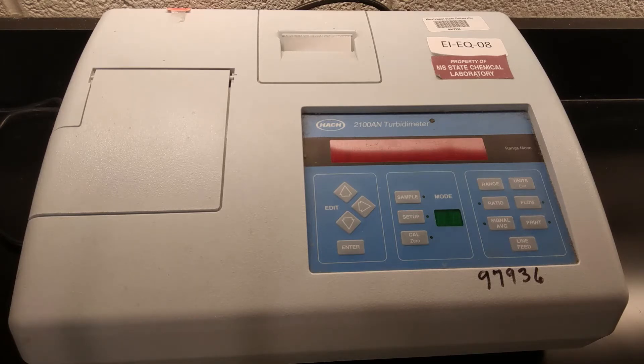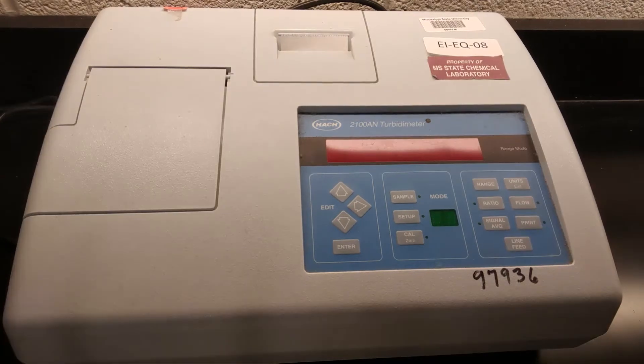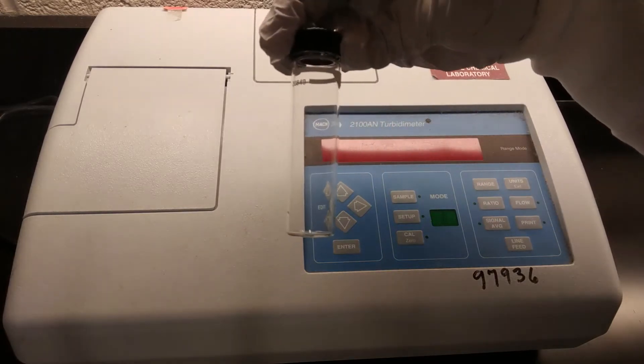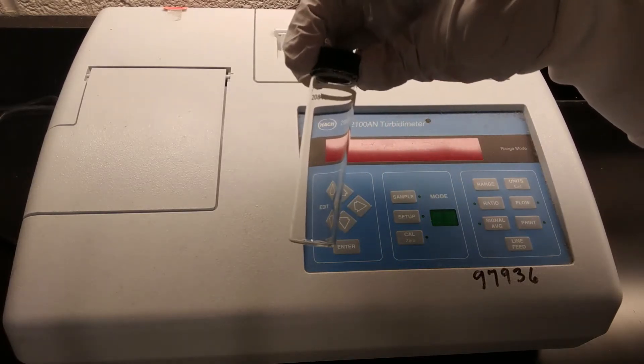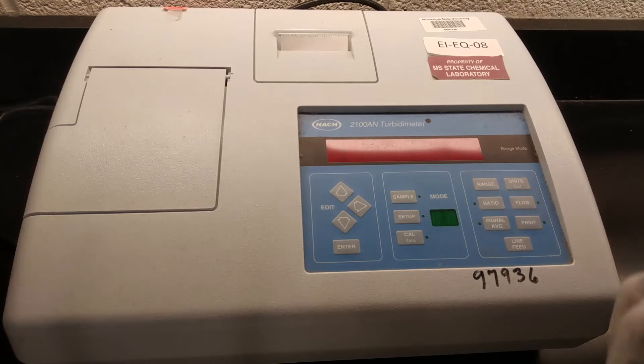Most of our supplies for our turbidimeter are kept in the drawer just underneath it, so we have everything that you need for it right down next to where the station is. Among the supplies that we have for this are our sample cells, which are glass or quartz vials that look like that.